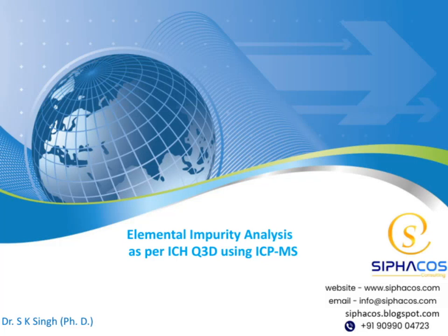Welcome. Today, we're diving into elemental impurity analysis, guided by the expertise of Dr. S.K. Singh. We'll explore how to apply the ICH Q3D guidelines using ICP technology. This sets the stage for understanding how to ensure safety and compliance in pharmaceutical analysis.